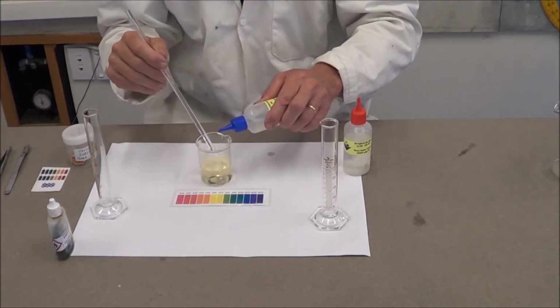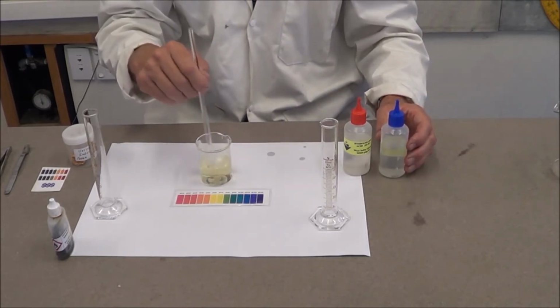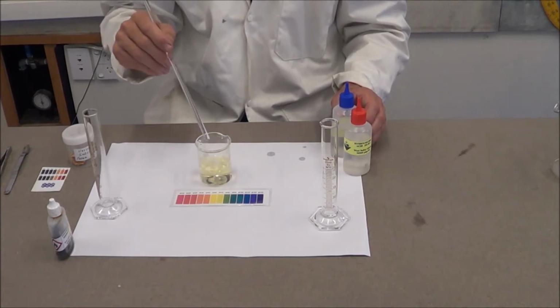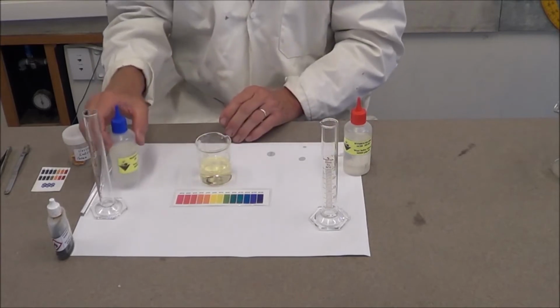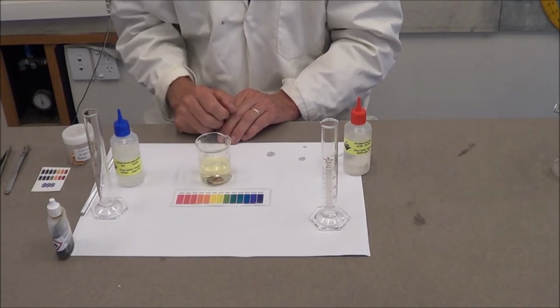I'll just add another half a drop to that. And there we have our universal indicator colour indicating a pH of 7. The acid should all be neutralised and there should be little or no leftover alkali in that reaction mixture.